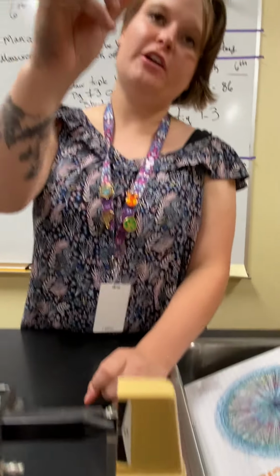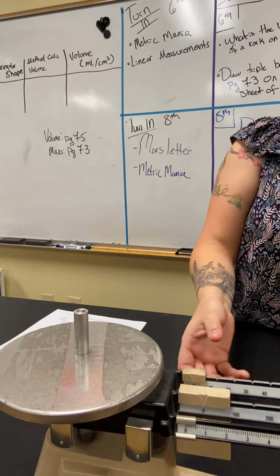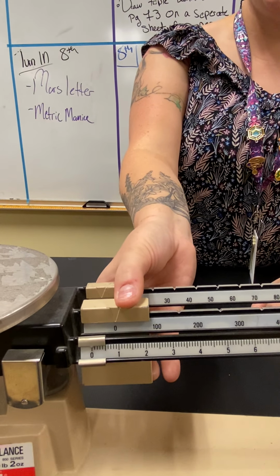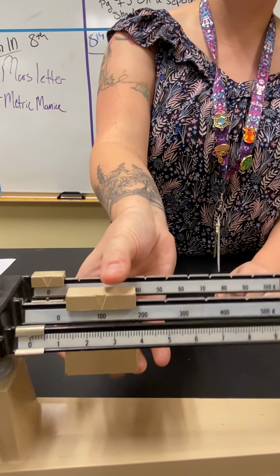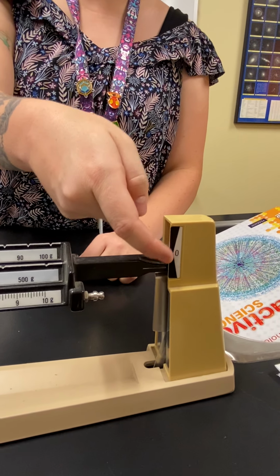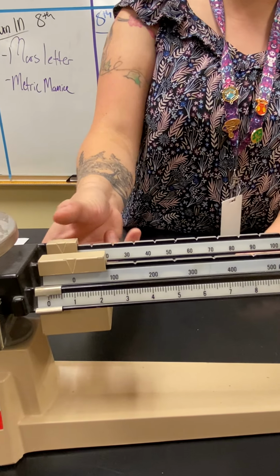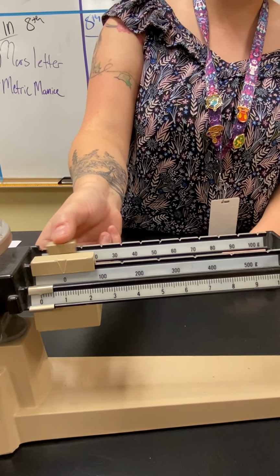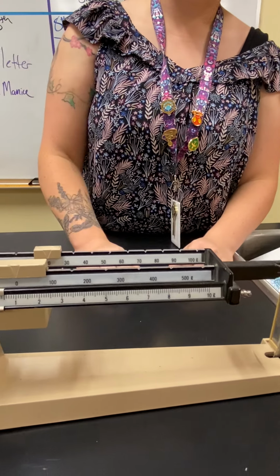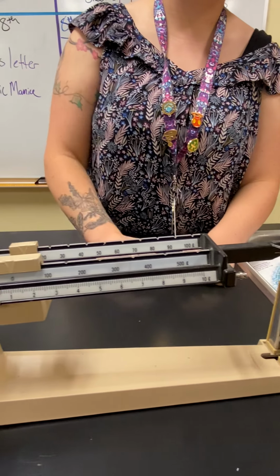All right, so first you get your object, put it on the plate. Now we start with the biggest, that is the hundreds. That's too heavy. Once this line drops below the zero line, you know it's too heavy, so we're gonna go back. So we know it's not at least 100 grams. What about 10 grams? All right, still got it. 20 grams proves to be too heavy. So we're gonna go back to that 10 mark.